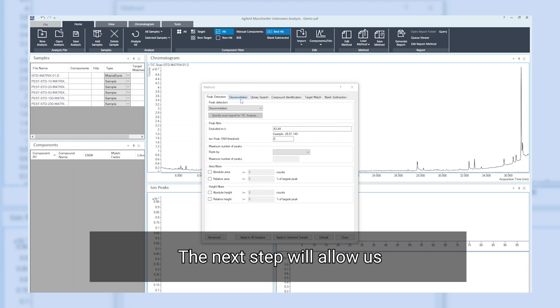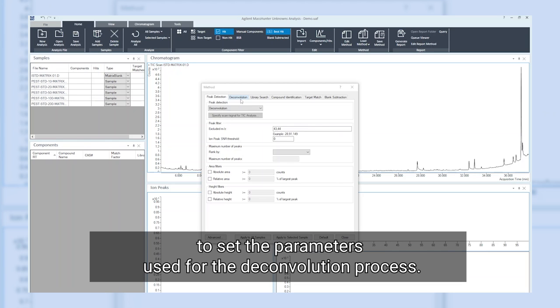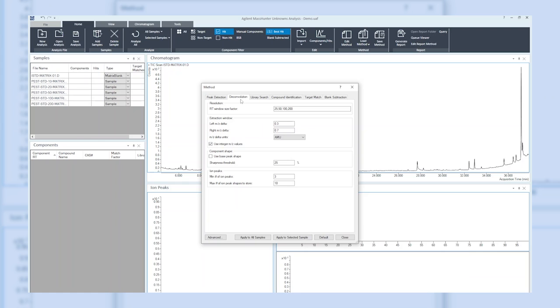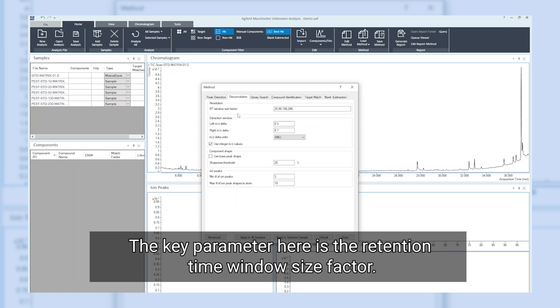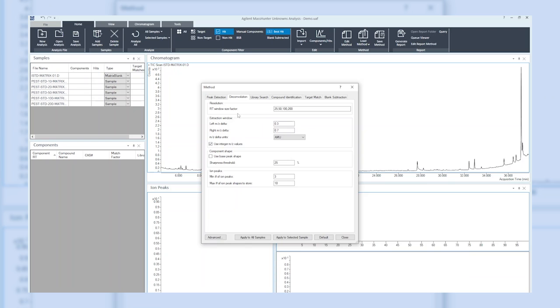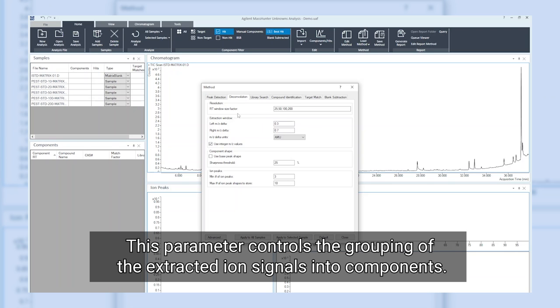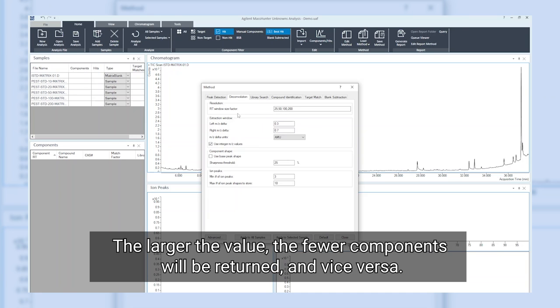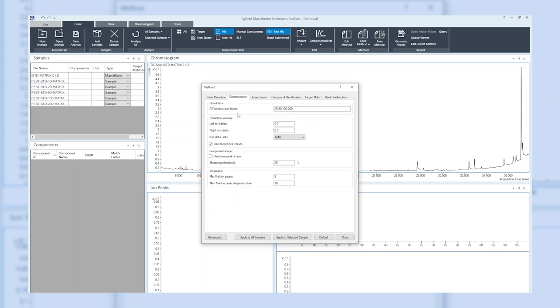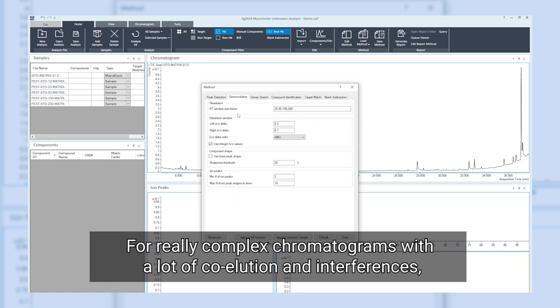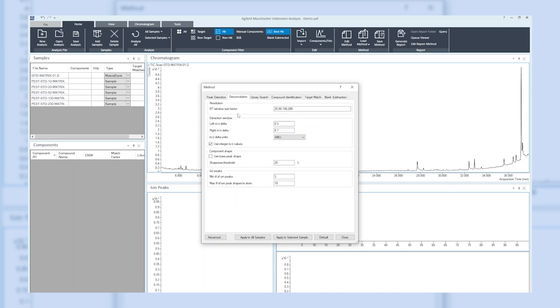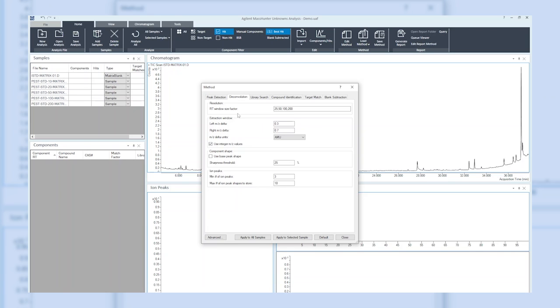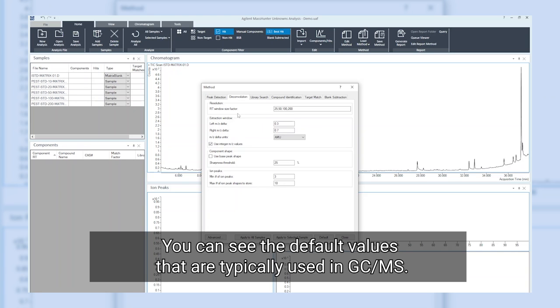The next step will allow us to set the parameters used for the deconvolution process. The key parameter here is the retention time window size factor. This parameter controls the grouping of the extracted ion signals into components. The larger the value, the fewer components will be returned and vice versa. For really complex chromatograms with a lot of co-elution and interferences, you would need to enter lower values in order to get them separated. You can see the default values that are typically used in GC-MS.